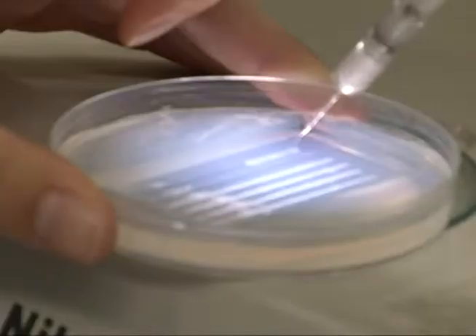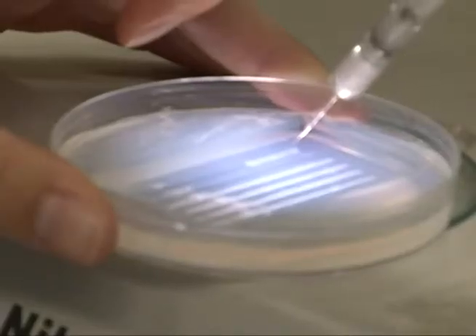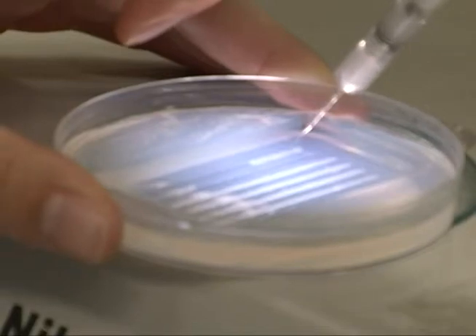So the trick to injecting these embryos is to line the needle up with the embryos, and then we push it through the chorion and through the yolk sac. It's important to make sure that it goes all the way into the yolk sac and not just through the chorion, because the MO will not be drawn into the consecutive cells as they divide.